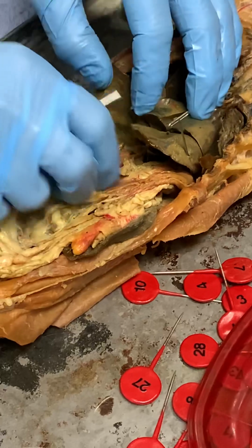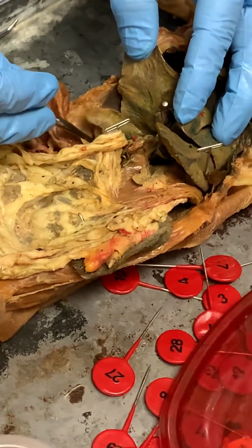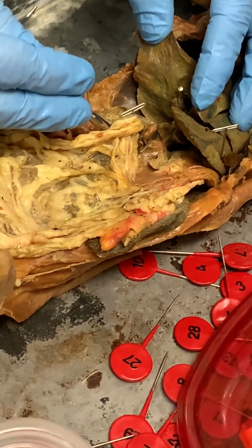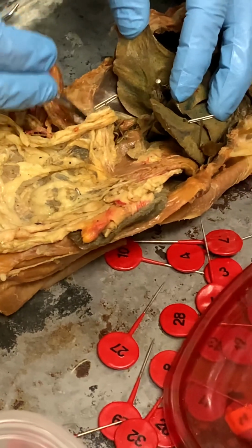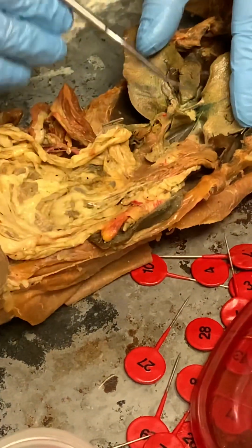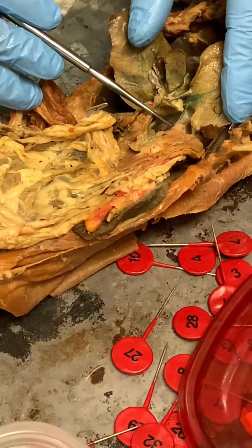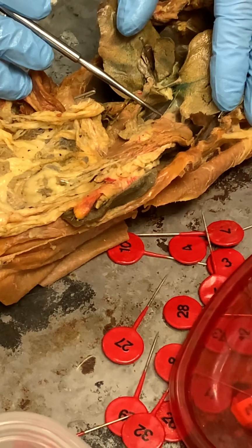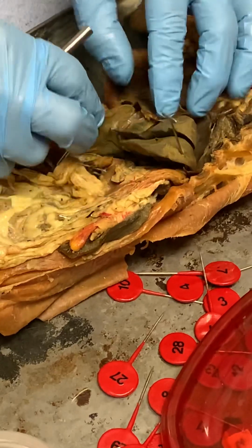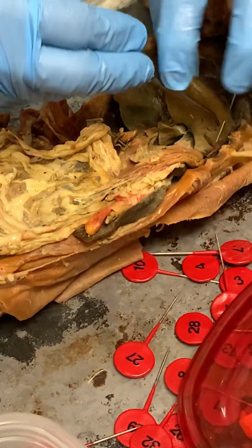Now the right lateral has a couple of lobes to it, so it's a little confusing. I wouldn't just mark this, but that's the reality of it. It's a little more confusing. This is the left lateral, and this right here, it's like a tongue. That is the caudate. Okay, right in the middle. It's caudate.